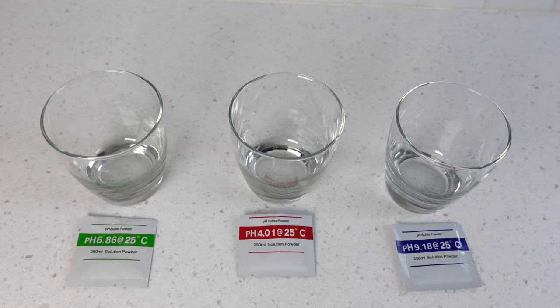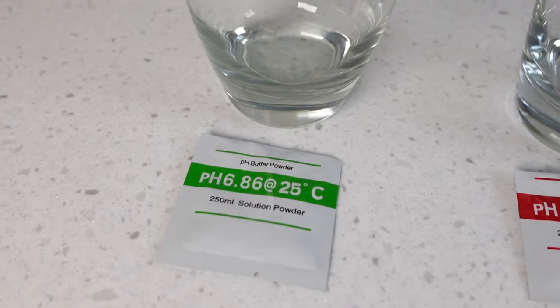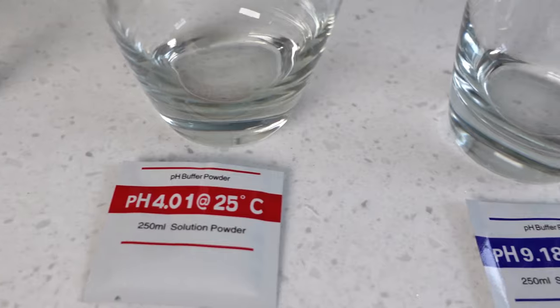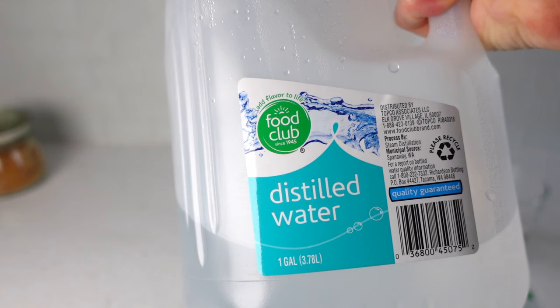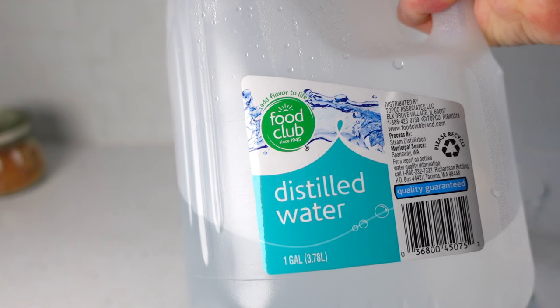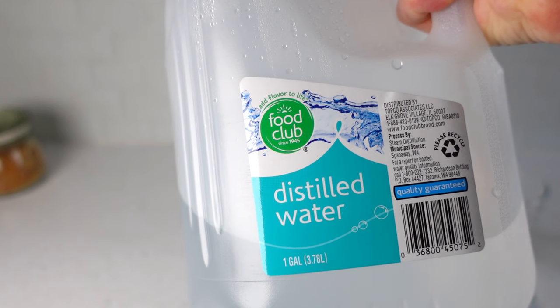Here's what's needed for the calibration. The meter comes with three packets of buffering solutions, so you need three glasses — one glass for each packet. You'll also need distilled water; the instructions specify this type of water is needed for the calibration.